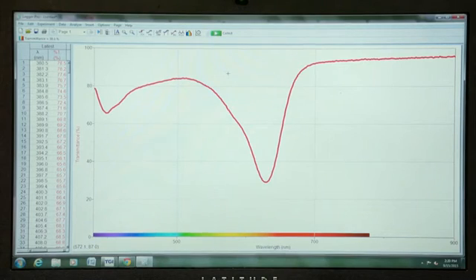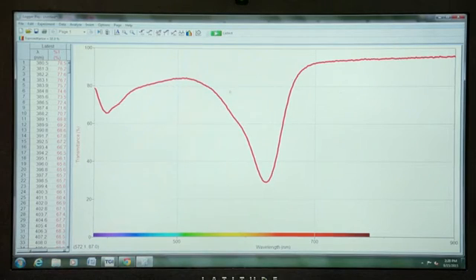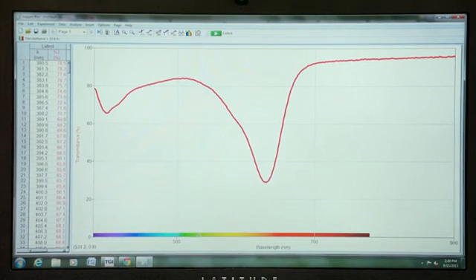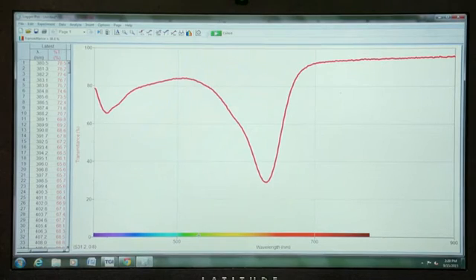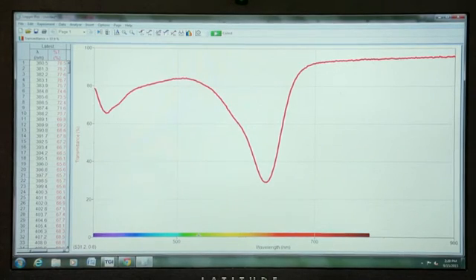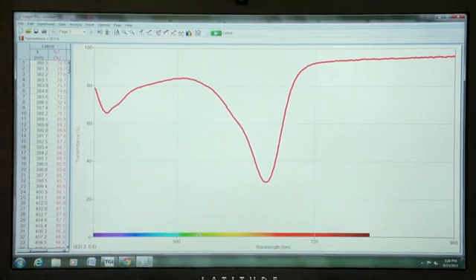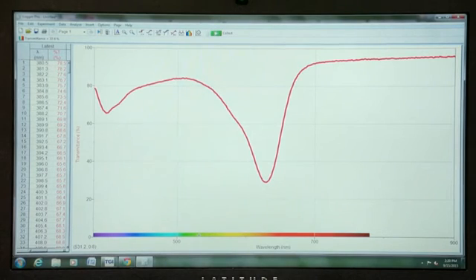Notice one other thing on the graph before we wrap up, and that is that there is a little strip of colored tape along the x-axis. This is a color reference to show the visible spectrum as it's displayed and measured on the SpectraVis Plus.